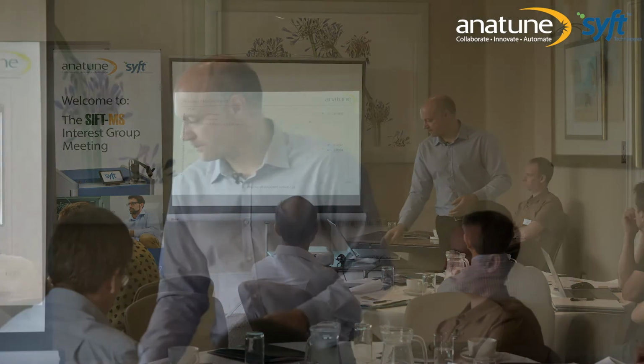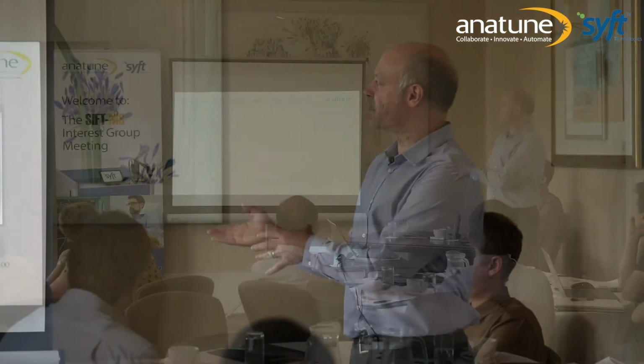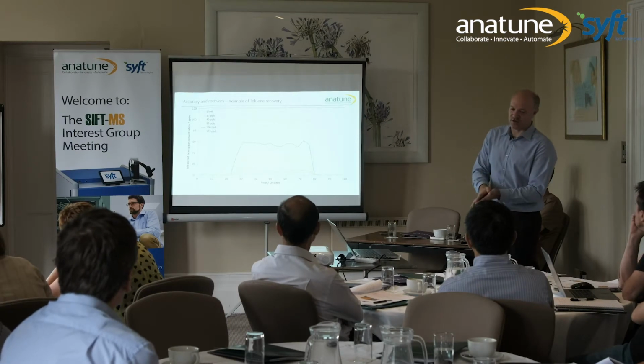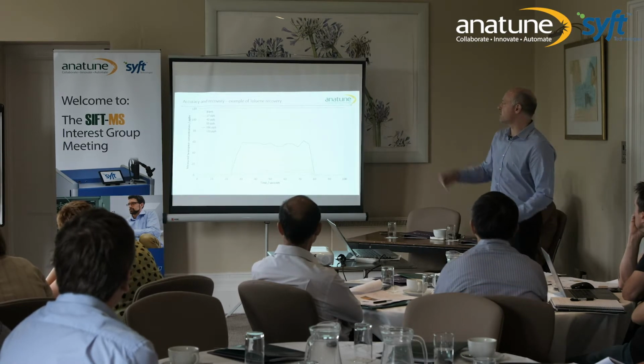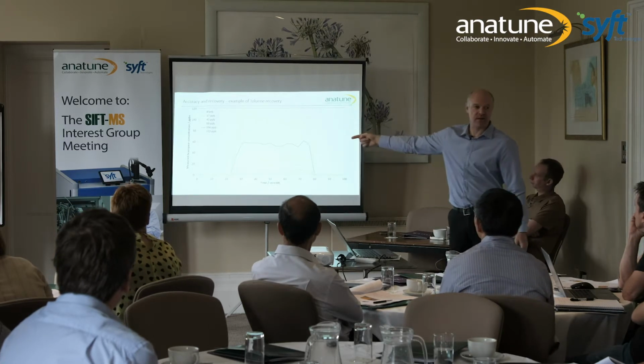The next part of the process is accuracy and recovery. What we do is spike known concentrations into our matrix and then try to recover it. In this instance, because the matrix is a solution of a fixed volume, I can do the spike experiment because I know the volume, so I know the spike, so I know the recovery. This is an example of recovering toluene at these various concentrations spiked into the solution.